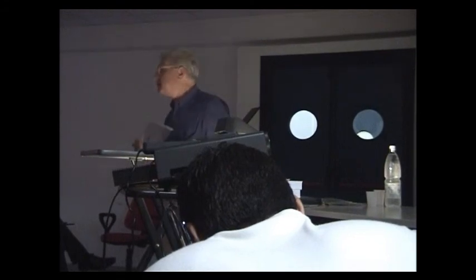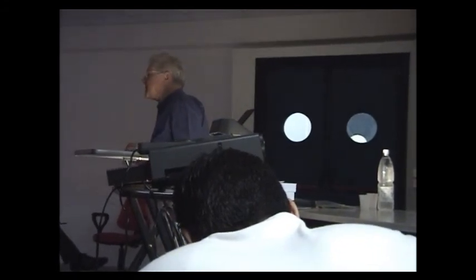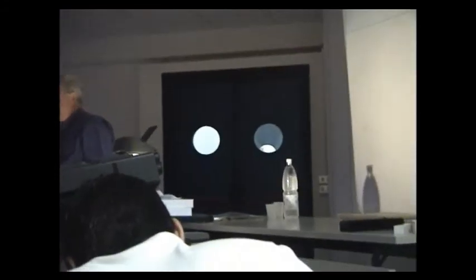If you need now to analyze materials like sodium, aluminum, magnesium, silicon, those materials are used as pigments for paintings. Then you cannot use an exit foil of aluminum, because the exit foil of aluminum will produce X-rays of aluminum, which is also perhaps in your material itself.